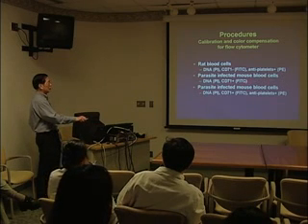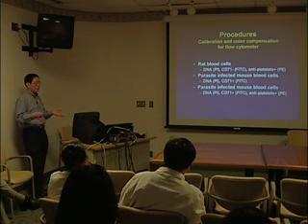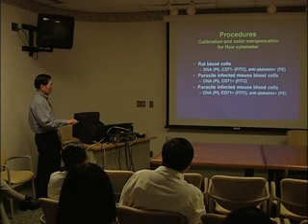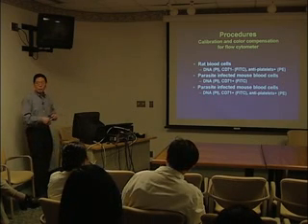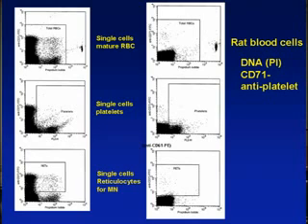The primary purpose, if you do flow cytometry, is to do this color compensation. So make sure that you don't have overlapping of the 2 markers. And third one will be, again, with parasite infected mouse blood cells. You have the DNA, you have both markers to allow you for a final setting of the instrument. So how do you go about it? Of the 3 separate calibration samples, I'll show you this thing again to sort of refresh your memory.